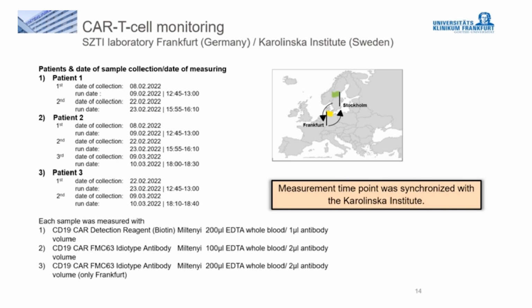We in Frankfurt performed an additional comparison with 100 microliter and 200 microliter blood as starting volume. Since we saw a decrease in CAR T cells with time-delayed measurement and stability analysis, as shown previously, the measurement was synchronized in time with our colleagues from Sweden.